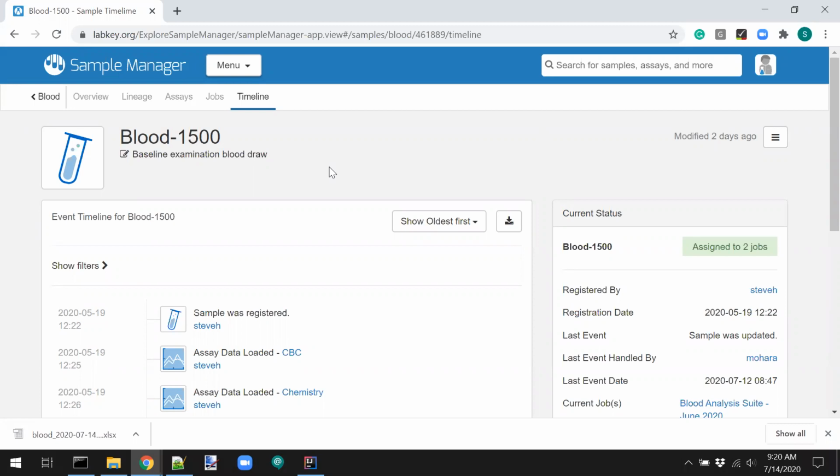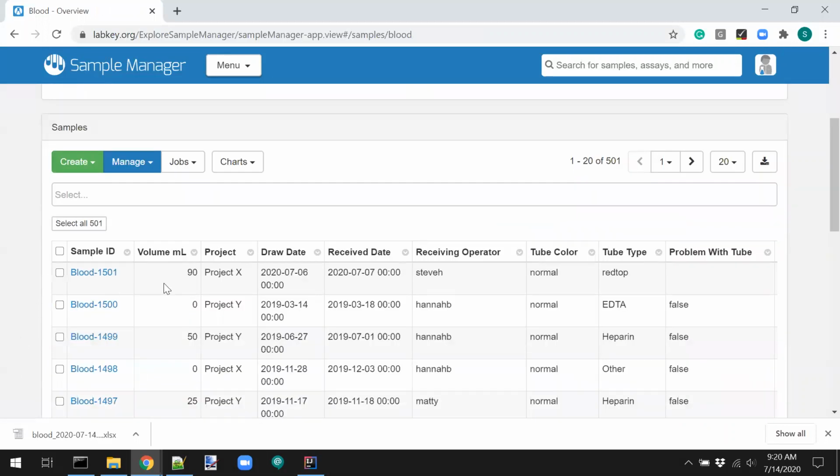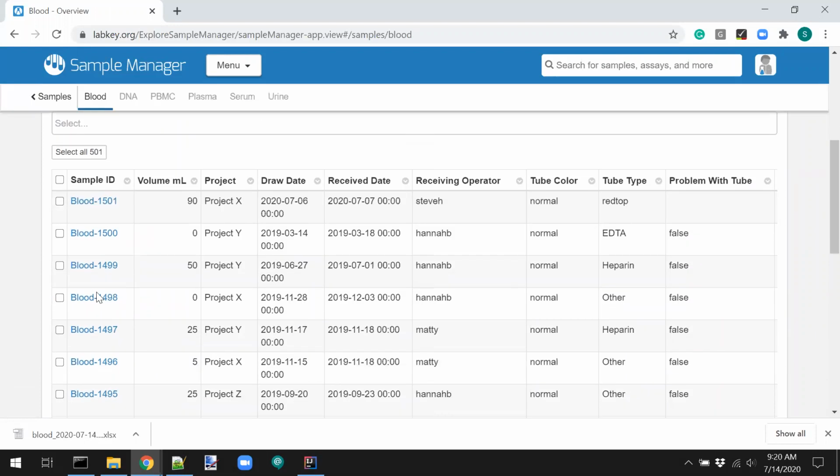It's how can you track volume remaining if users are taking samples, making aliquots, and using volume? Yeah. Well, right now you just do it manually. We can just go and show you how it's done. I had the forethought to put a volume column here in my sample tracking.